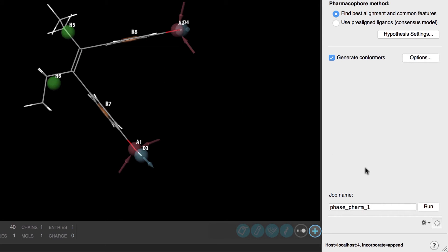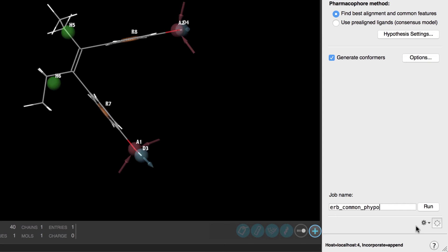Let's rename the job. Now since we have quite a few actives and we'll be using the phase hyposcore formula which runs a small scale virtual screen against the glide decoy data set this job can take a few hours on a single CPU or less than an hour if distributed across eight CPUs.